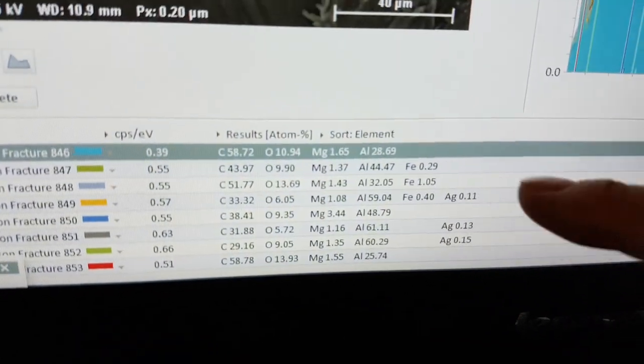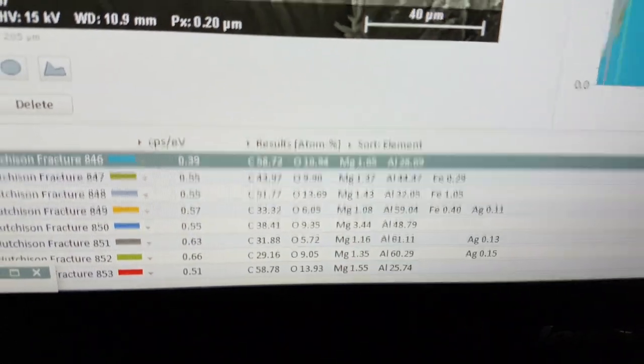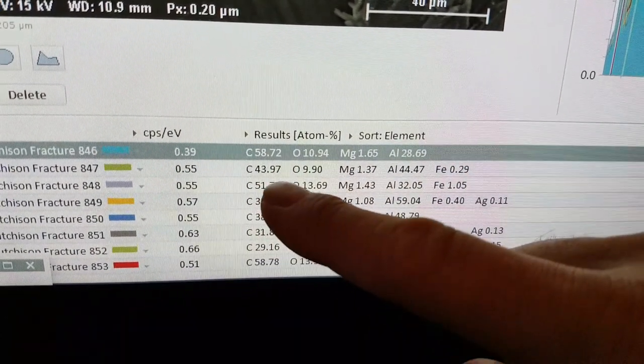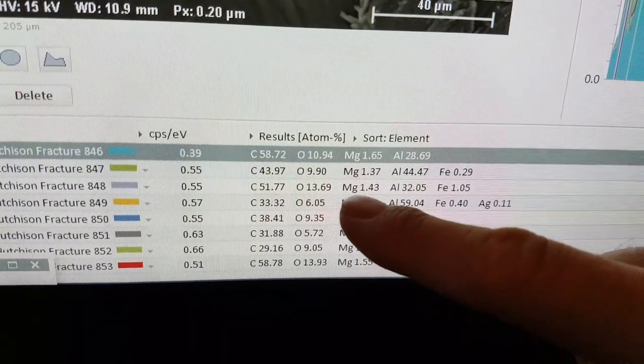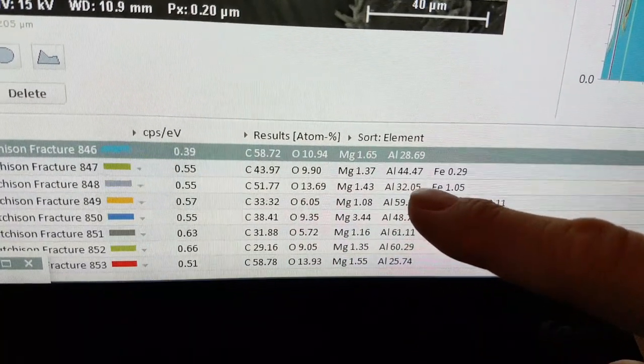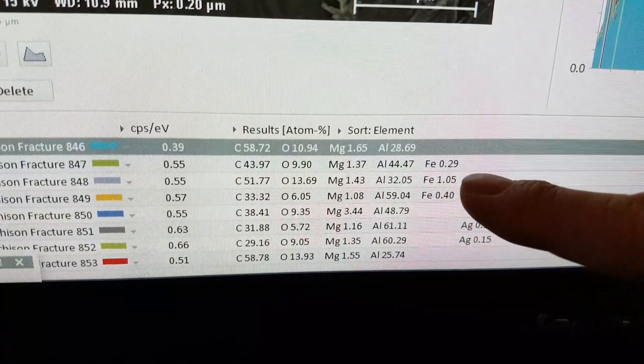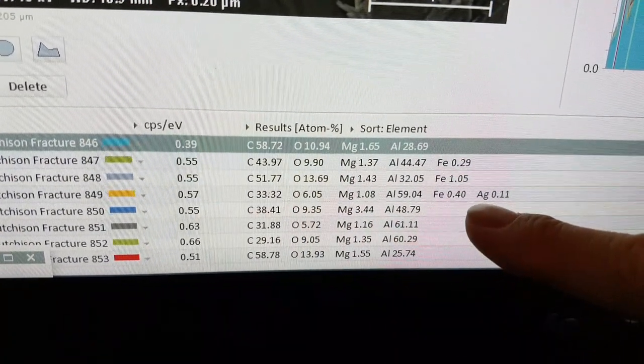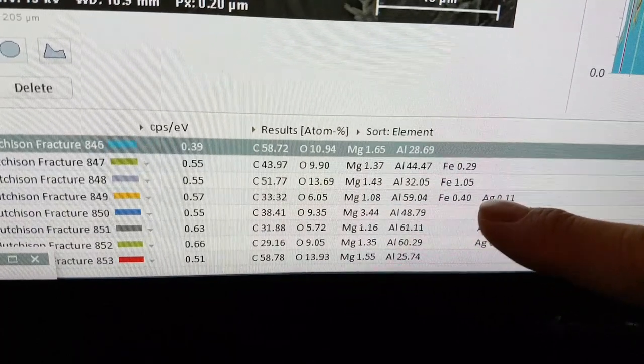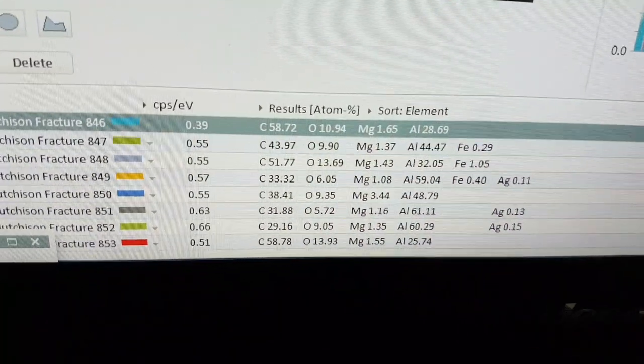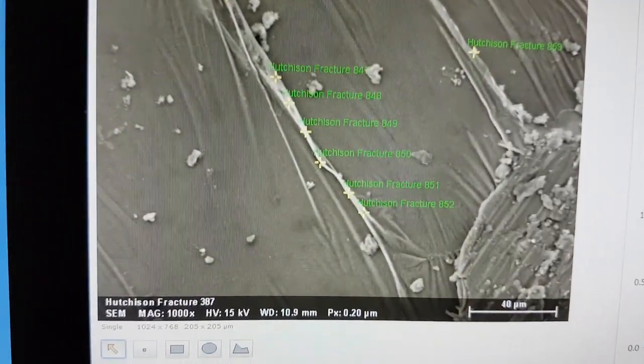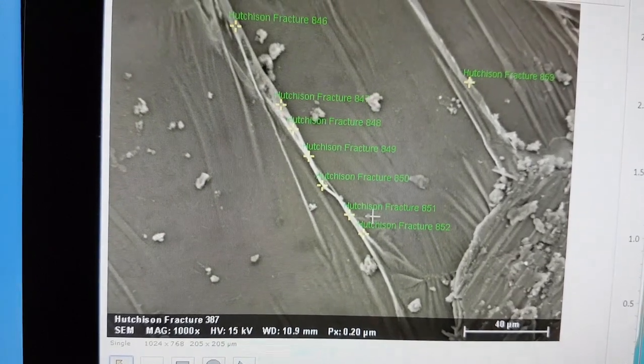And it would appear that as you go down the strand you have like carbon, oxygen, magnesium, aluminum, and then carbon goes down. Oxygen is about the same, magnesium is about the same, but aluminum goes up. And then there's a bit of iron, and then there's more iron, and then there's a little bit less iron. But then there's silver, so that's quite fascinating, and this is part of the actual structure. So we're going to have a look at a couple more of those and see if we see the same pattern.